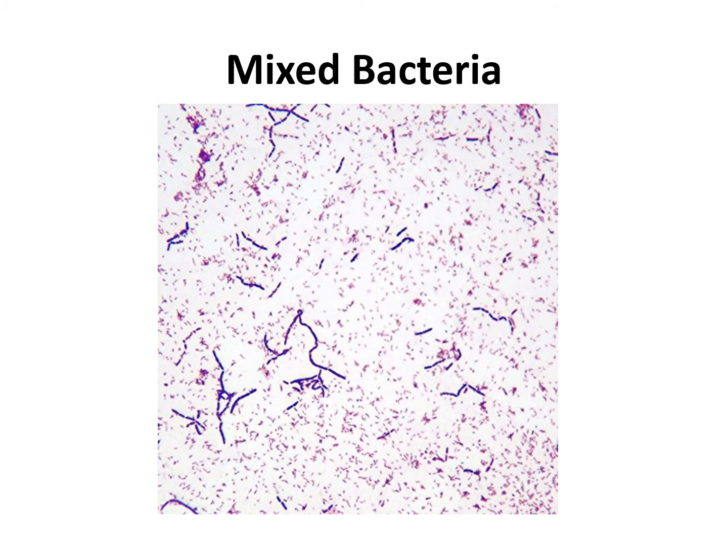In class, you will look at a slide that has mixed bacteria on it. So these are the prokaryotic cells, and the bacterial cells are very, very small, so you won't be able to see too much detail on them, but you should be able to see some cells that look like rod-shaped cells, and maybe possibly smaller rod-shaped cells or circular cells.